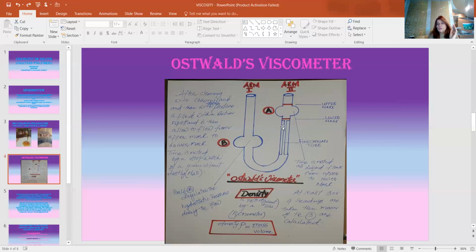And what I was telling about the adjustment of the capillary: that capillary is not supposed to be tilted. A little bit of tilt is not allowed. It has to be straight. This capillary position is supposed to be vertical. When you have clamped the viscometer on the stand, it is supposed to be all vertical, right? There shouldn't be a little tilt seen.